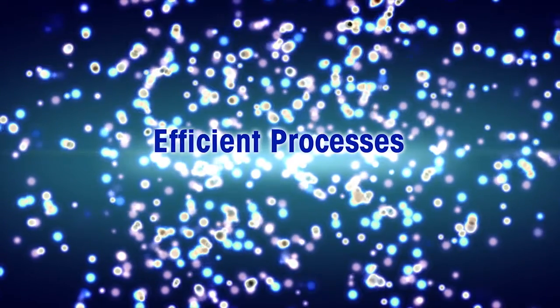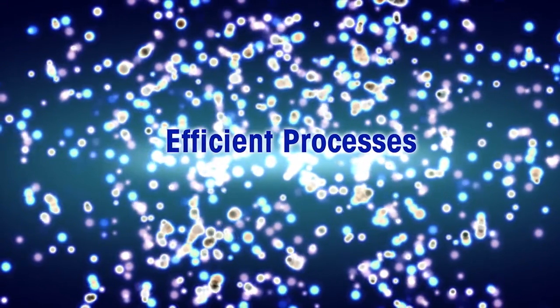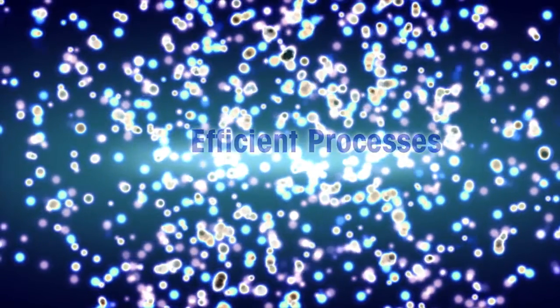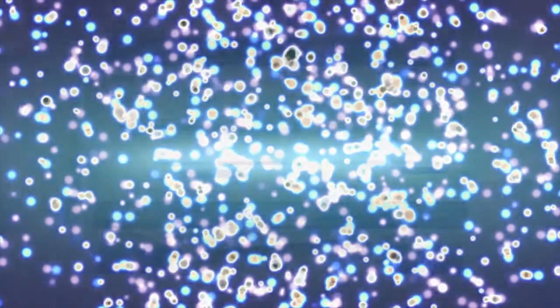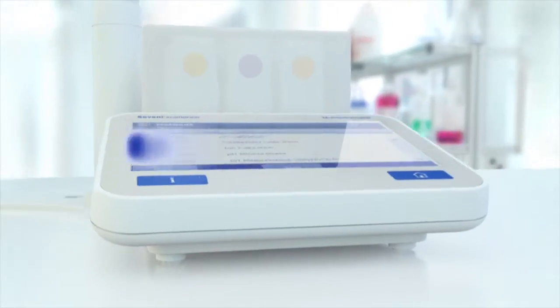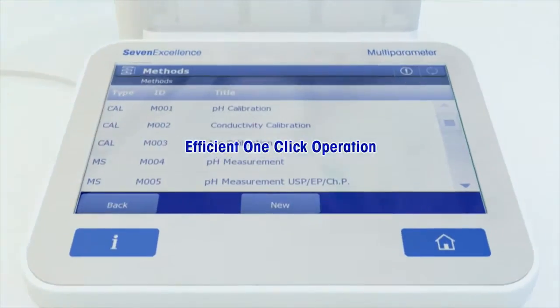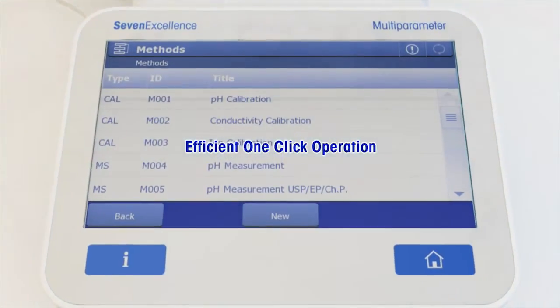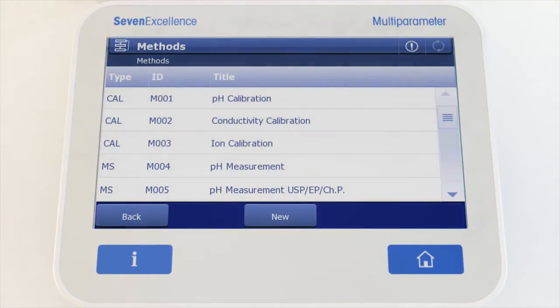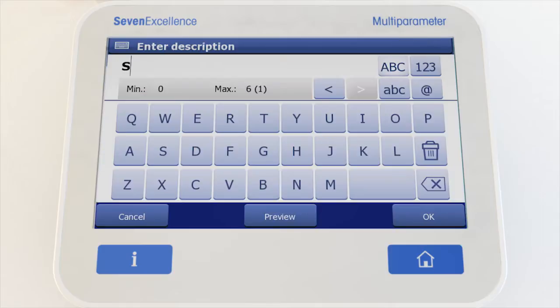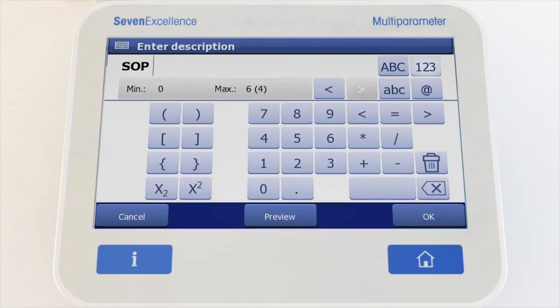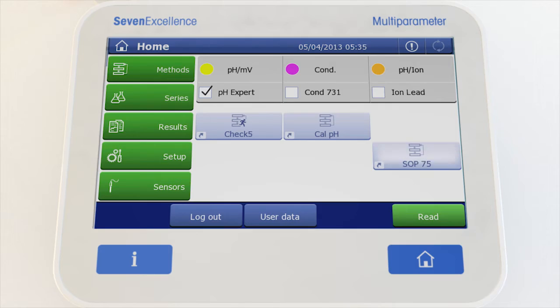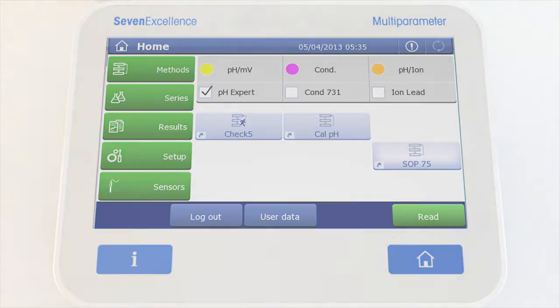Use 7-Excellence's unique features to boost the efficiency of your processes. Program your SOP as a 7-Excellence method and ensure that each analysis is performed under identical and correct conditions. By a single tap on a customized shortcut, authorized users can start a method quickly and safely. One click.